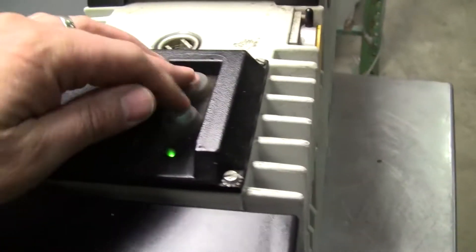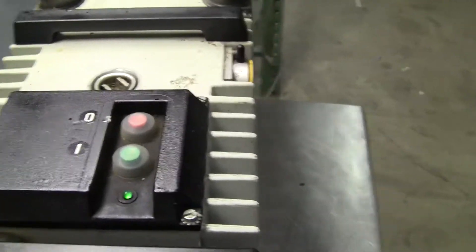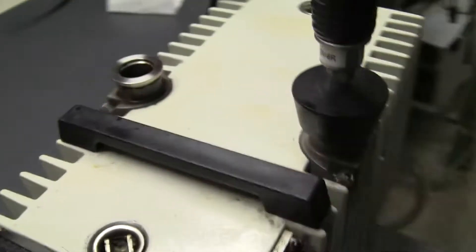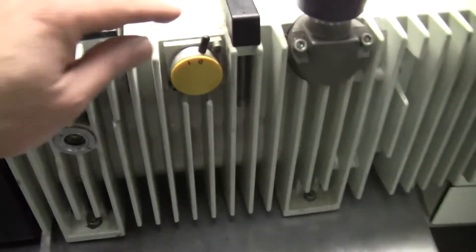On-off button's not really working, but turn on the pump, turn off the pump. Being sold as is, ballast works.